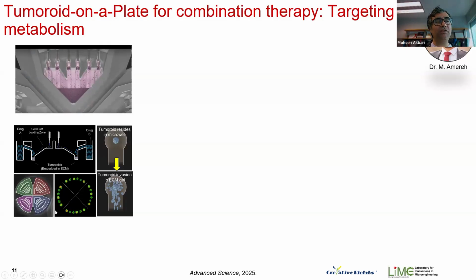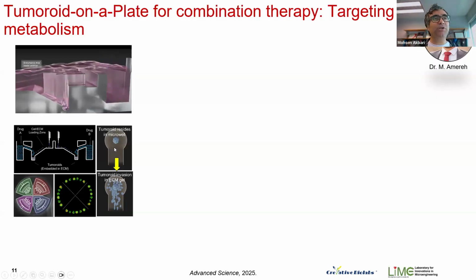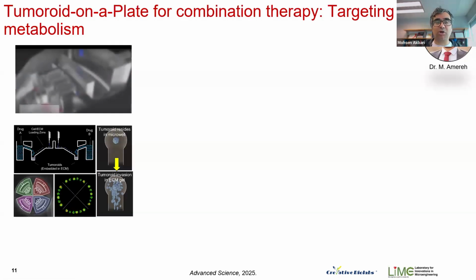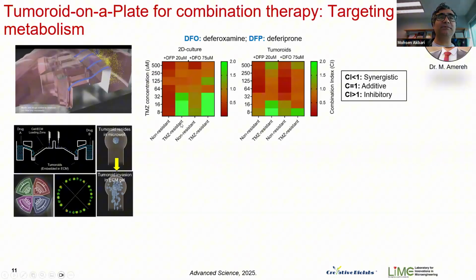The benefit of this new design is that not only can we create tumoroids and investigate their size change, but we can also look at invasion of these tumors into the surrounding tissue, specifically if you include both the tumor cells and all the tumor microenvironment compartments, including healthy cells, for example.